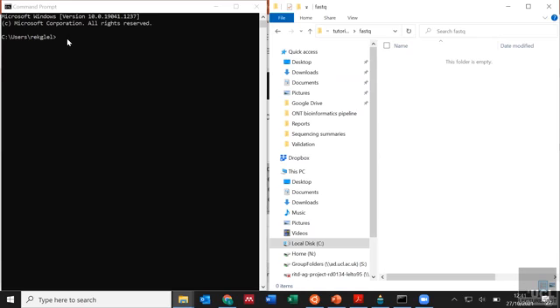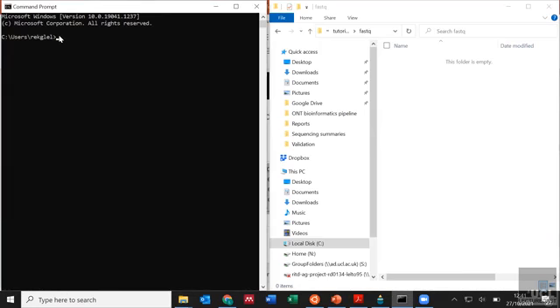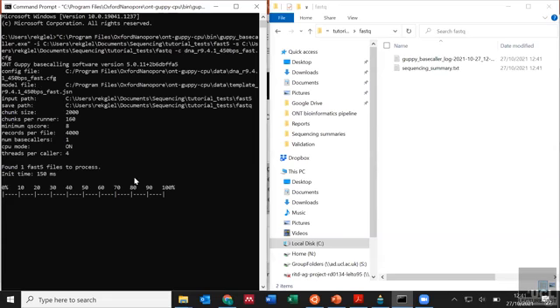And so if I paste that into here, please. No, okay, try again. If I paste that, yeah, come on, there we go, and press enter, hooray! So you can see that that is now base calling. Because it's only one file, it shouldn't take very long, but you can see it adds information files first. And once it's got a bit further, you should see that the fastq file will appear.